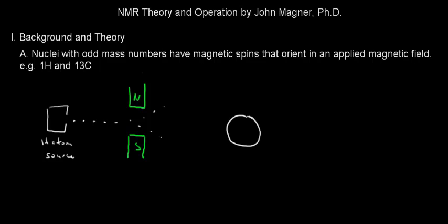And so a magnetic moment I'll represent with an arrow. So this is an H atom, a proton, the nucleus of a hydrogen atom. And the reason it's called a spin is because this magnetic moment is the same sort of moment you would expect from a spinning charge. So if the charge was spinning, we'd produce a magnetic moment. It turns out these atoms really aren't spinning. These magnetic moments are an intrinsic property of hydrogen atoms and certain types of atomic nuclei. But the name stuck, and so we refer to them as magnetic spins.